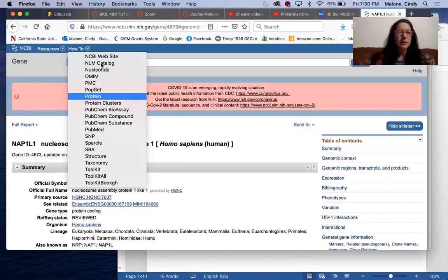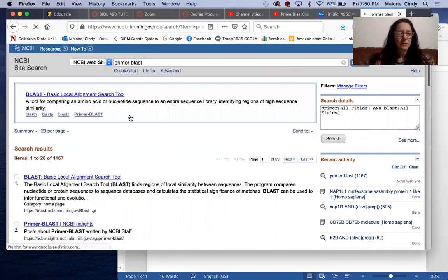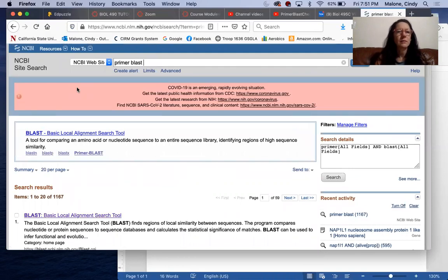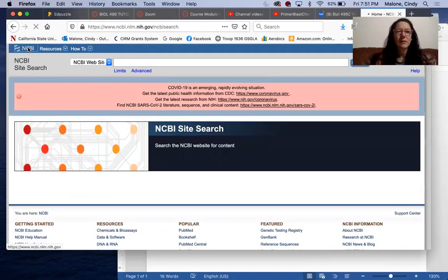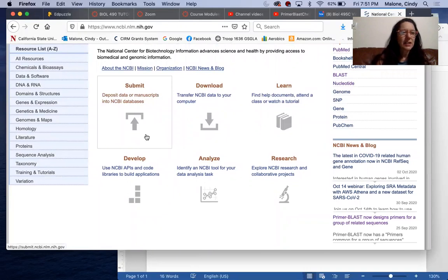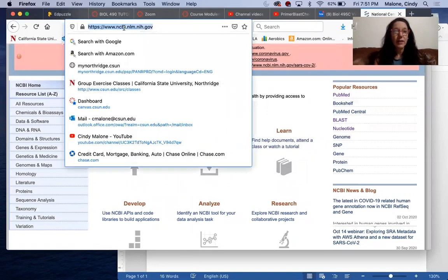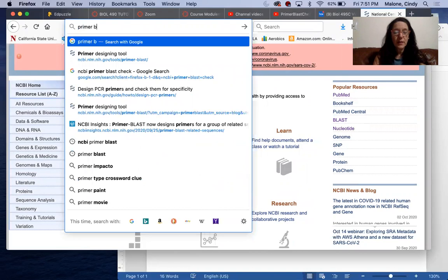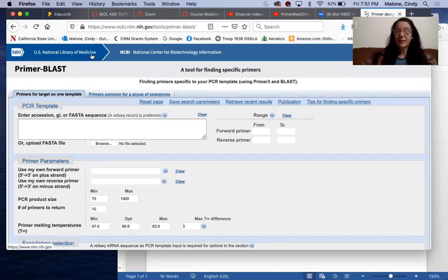Really? Seriously? All right, website. Can I just get the page, people? They don't. Really? Nice tutorial, Malone. Okay. Oh boy, I swear. Really? Okay, fine. Primer blast. Why does it take me so long? See, even I can't figure this out either.